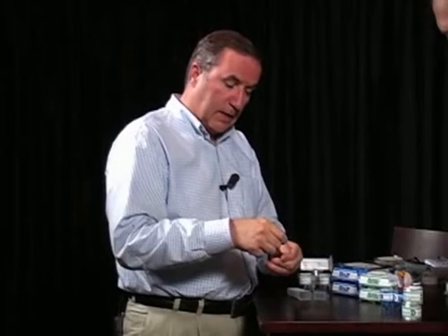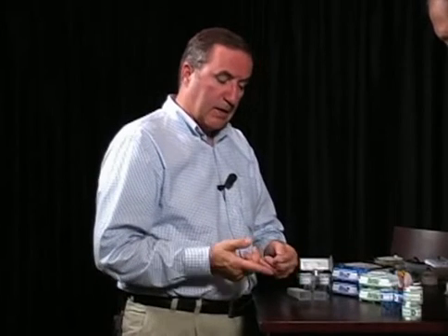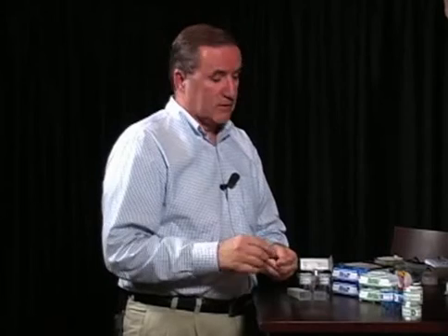I'm not burnishing it down with my finger. I just want to lay it on there so that it adheres. Because the lab later will pick this back up and put mounting medium under there, or stain if they wish, and then analyze it. So if you burnish it down, it's going to break all the structures, and it'll be difficult sometimes to associate the spores with the structures. So no pressure is needed at all.